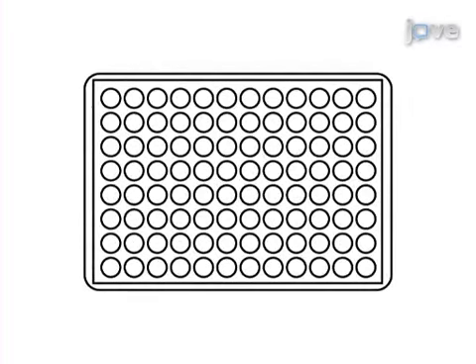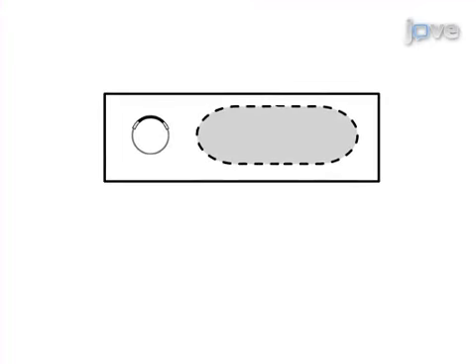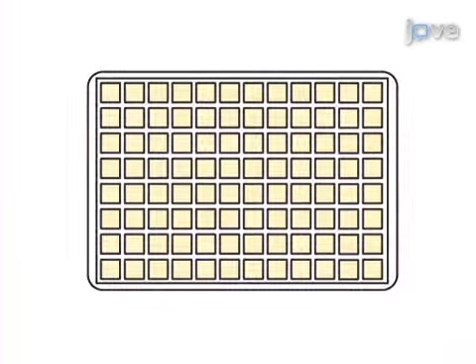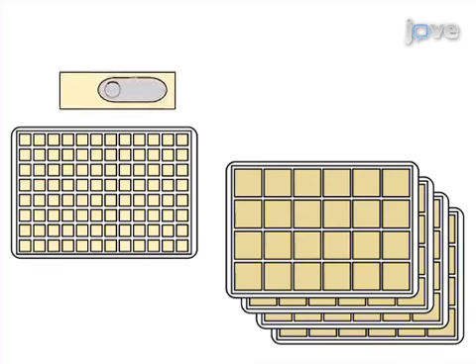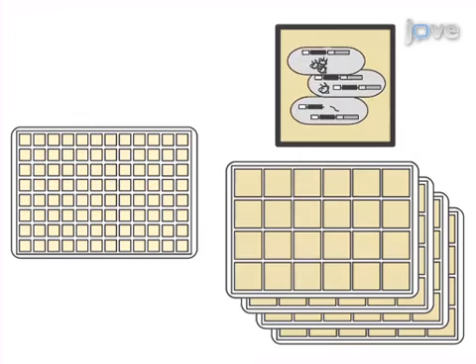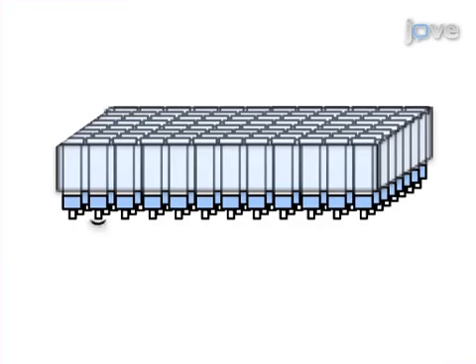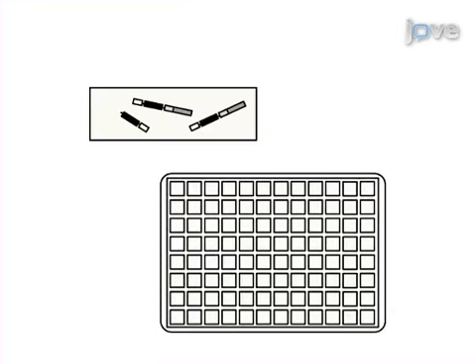This is accomplished by first inoculating 96 well pre-cultures with cells transformed with plasmids encoding the target fusion proteins. The next day, 24 well plates filled with autoinduction media are inoculated with the overnight pre-cultures to generate expression cultures. After harvest and freezing, soluble proteins from the expression cultures are then purified by immobilized metal affinity chromatography.